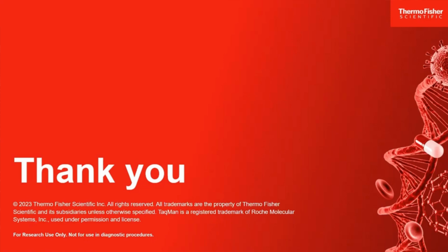Okay, great question. So CQ confidence: many of our real-time PCR software programs produce what might be called quality control parameters. There's two of them listed here, CQ confidence and AMP score. CQ confidence is based on the shape of the amplification plot. In other words, it is the confidence that the shape of the amplification that you're seeing is consistent with a true or ideal amplification plot shape.